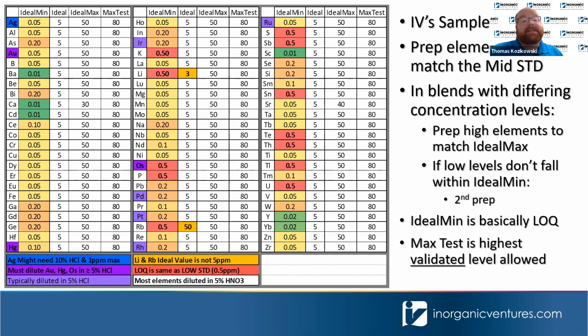I had a silicon example where we ran it at 250 ppm and it was spot on, even though the calibration range was 50. It actually passed with a very small error. So again, it does depend on what you validate though, because your auditors will care about that.